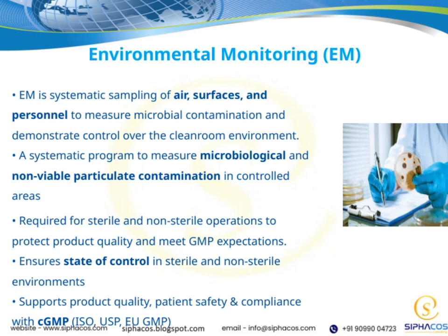Now, why is this important? Because it's required for both sterile and non-sterile operations. It's essential to protect product quality and ensure we meet good manufacturing practice, or GMP, expectations. By regularly monitoring, we can confirm that our environments, whether sterile or non-sterile, are maintained in a state of control.